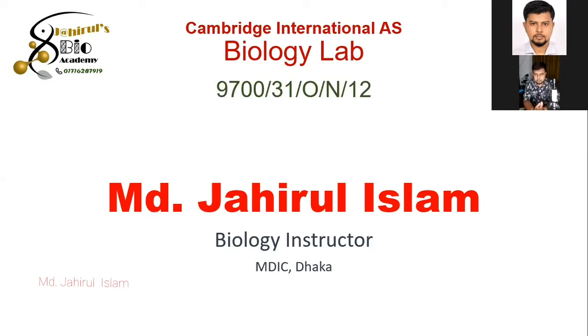Today, at first, I'm showing how to solve it. Actually, you know that a practical class cannot be done without actually doing it physically, but school is closed, so we are unable to go to school and do a physical class. So that is why I'm here. I'll show you how to do the microscope part of this question.